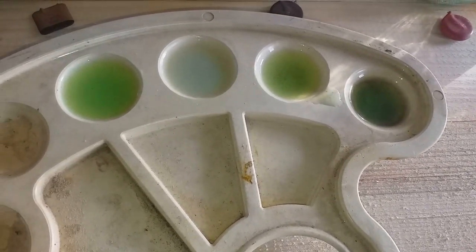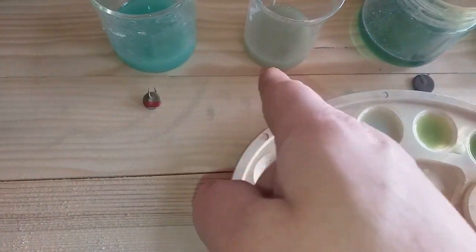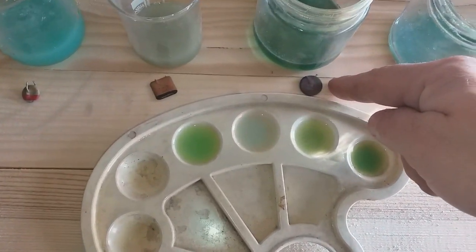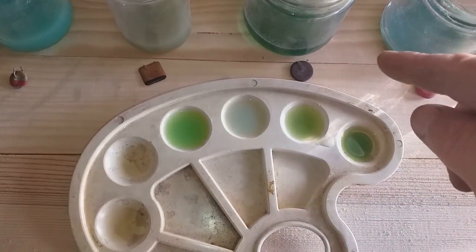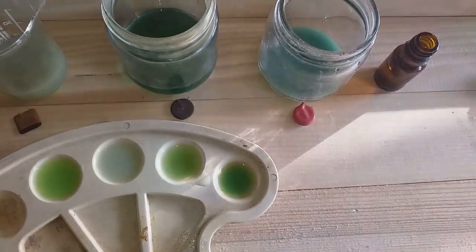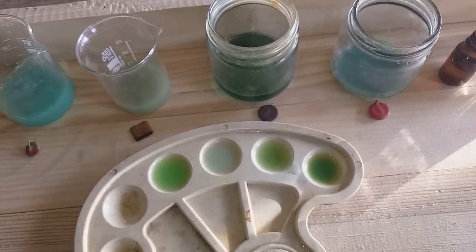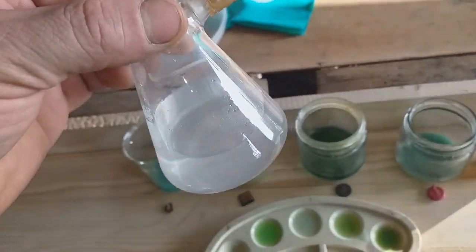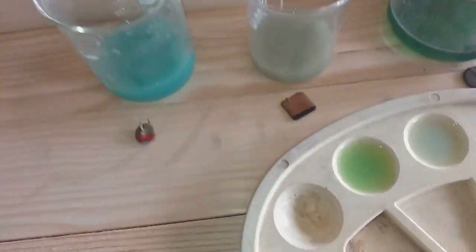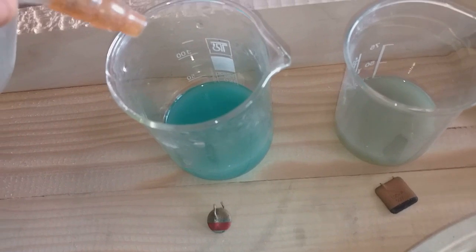Pretty good. So once again, let's see the summary. The first one contains palladium. The second one doesn't contain palladium. The black one, the third one, contains just a trace of palladium. And the red one gives a very, very good test result on palladium. So now next, in this little beaker I have some hydrochloric acid. I will add hydrochloric acid to every solution to see if I can drop some silver.